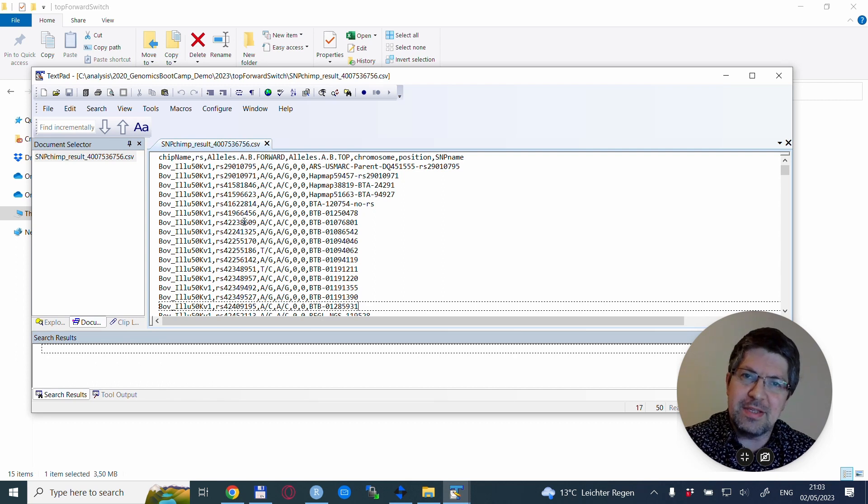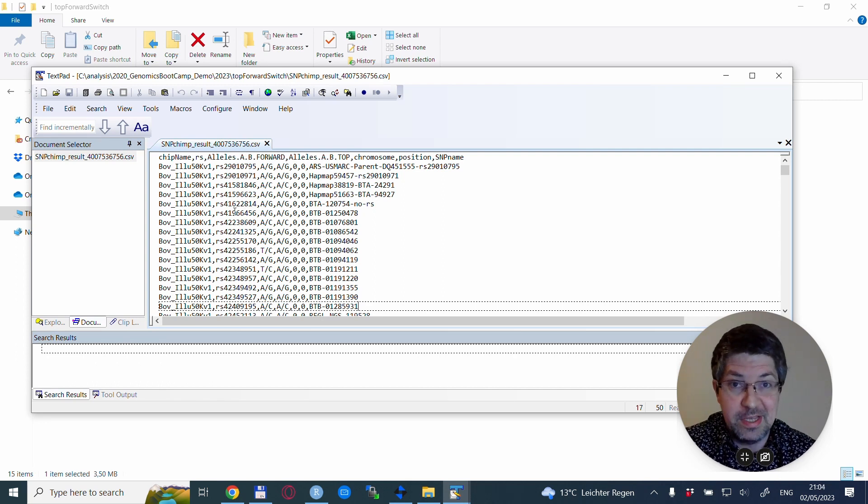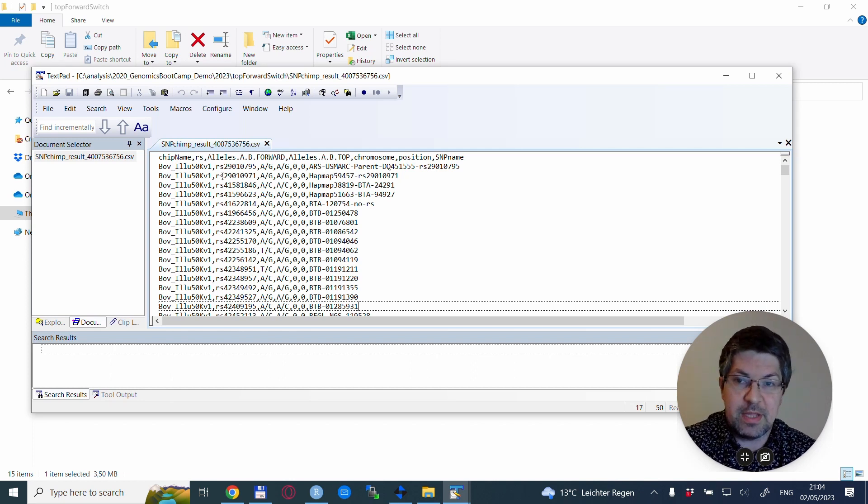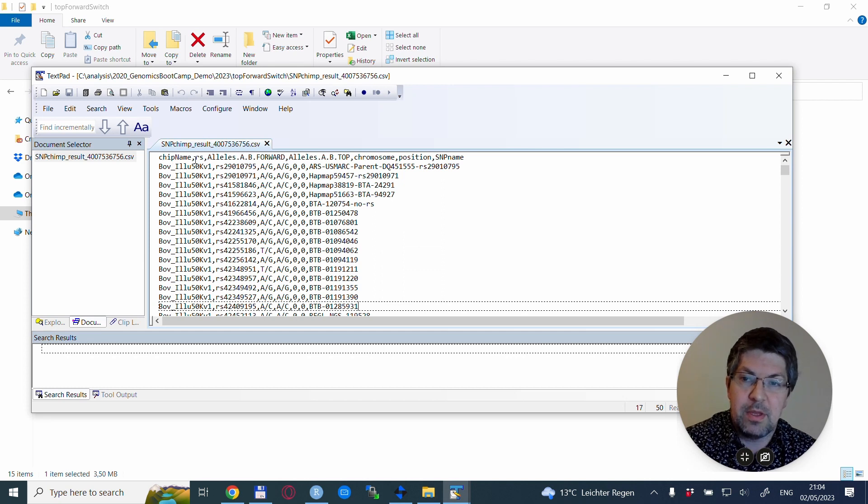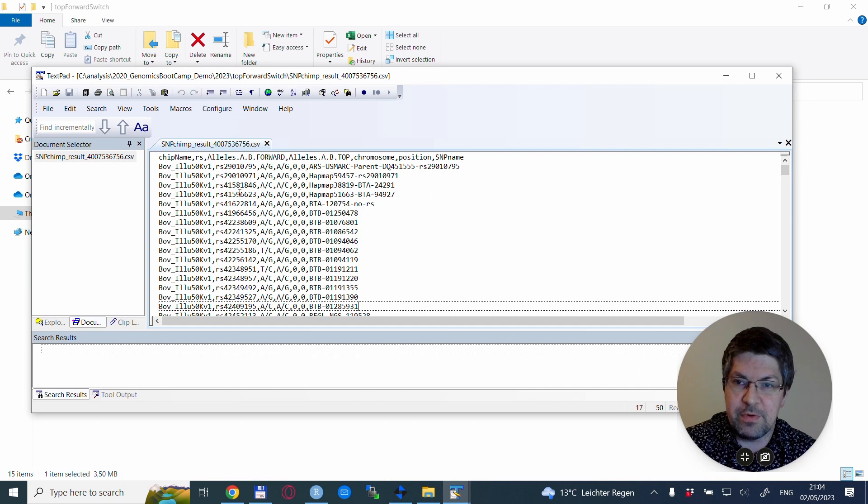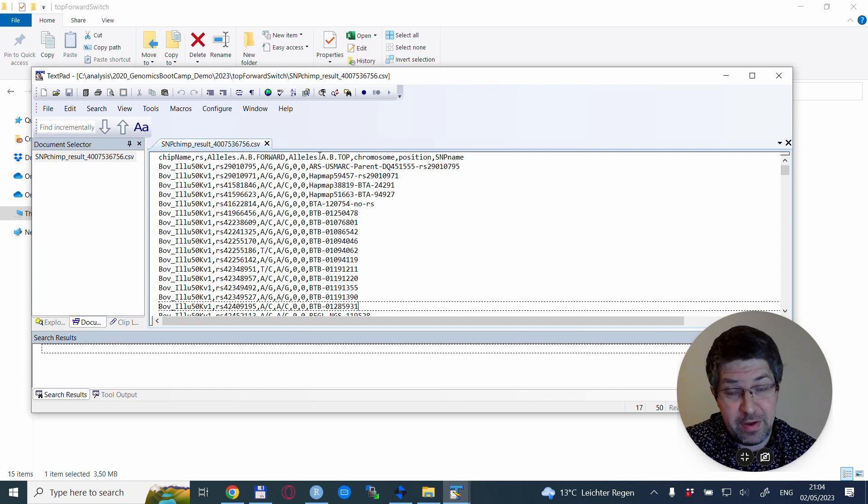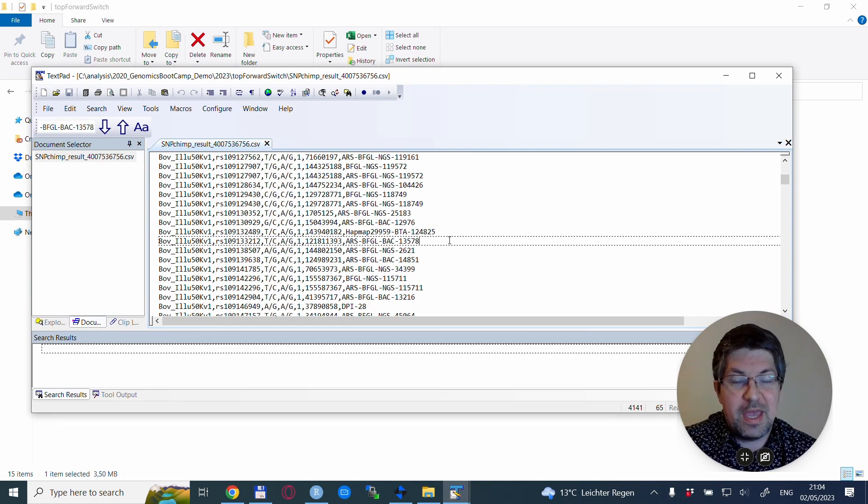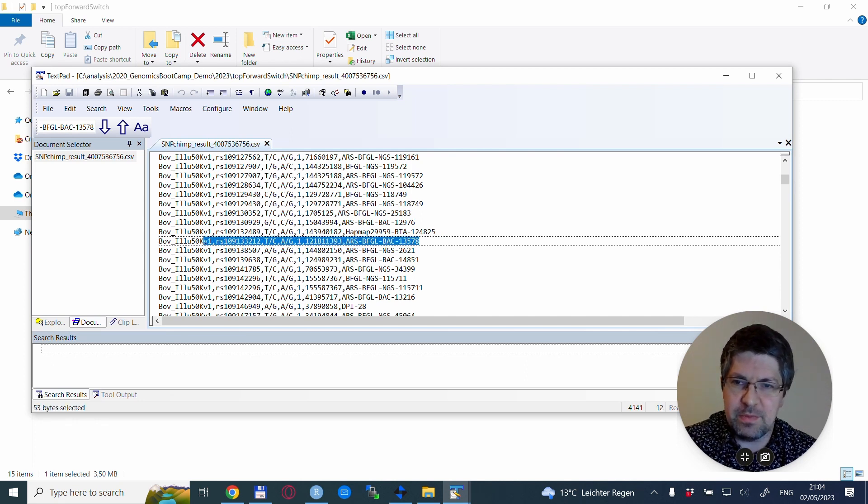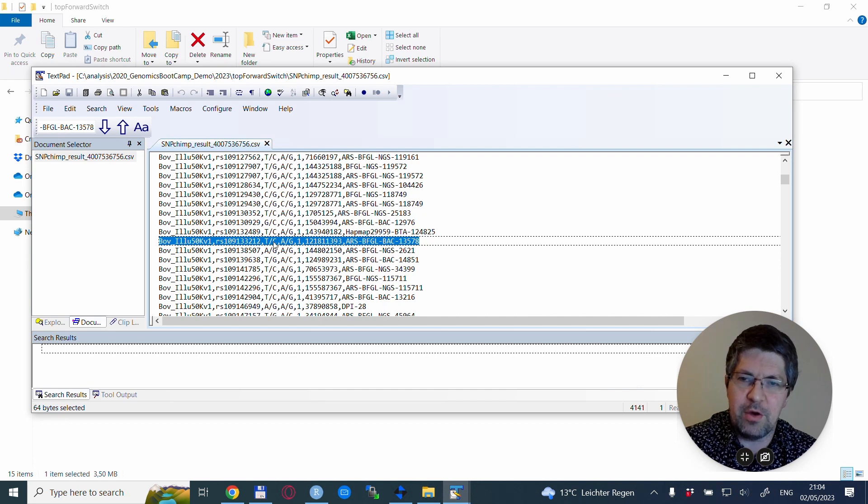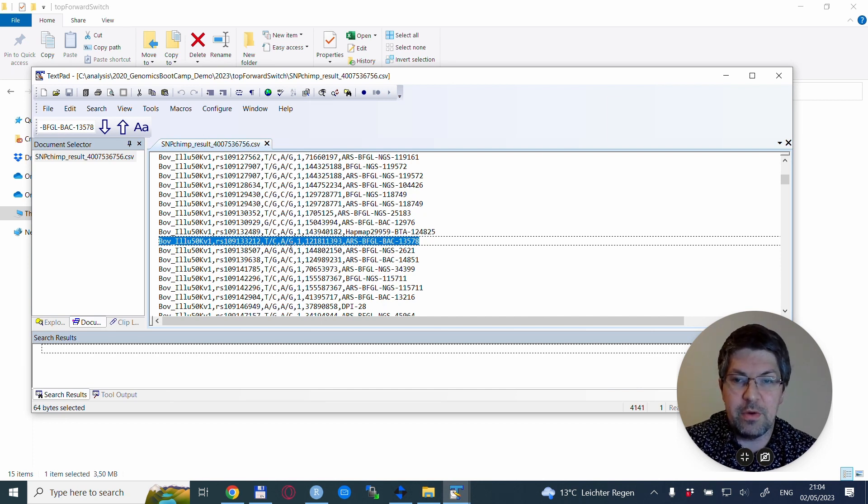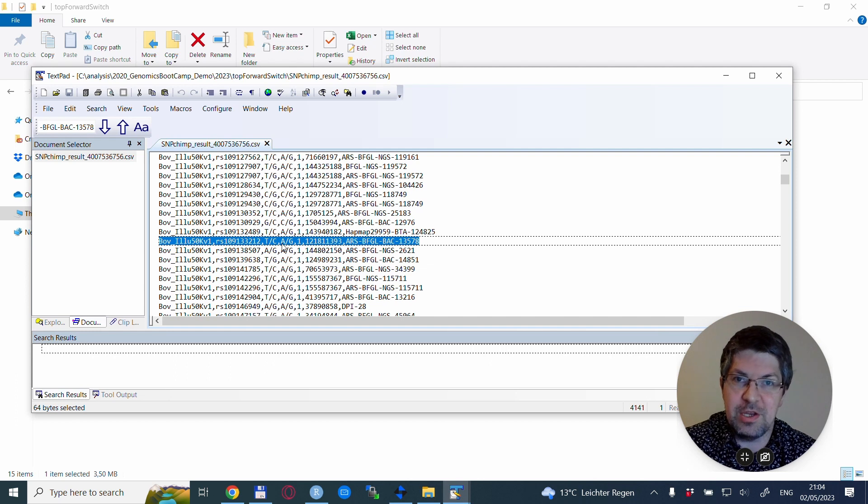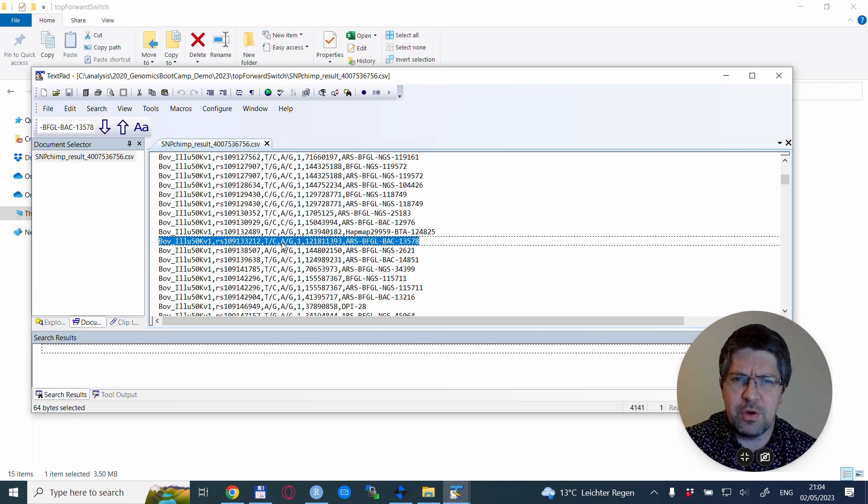The file you downloaded is a CSV file. It has a differently shaped and formatted header which I changed somewhat to get rid of the spaces. What you have is chip name, RS code, allele AB forward, allele AB TOP, chromosome, position, and SNP name. If we search for the same SNP as before, indeed one coding is TC and the other coding is AG. With this file we have a translation between TOP and forward coding.